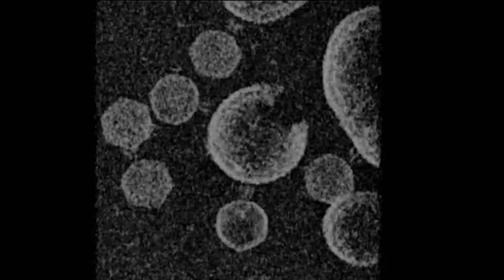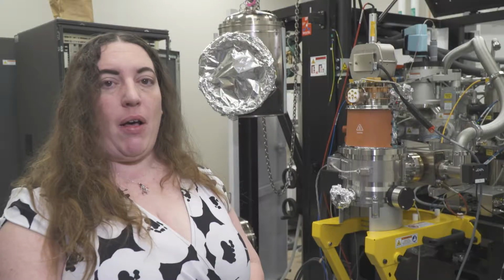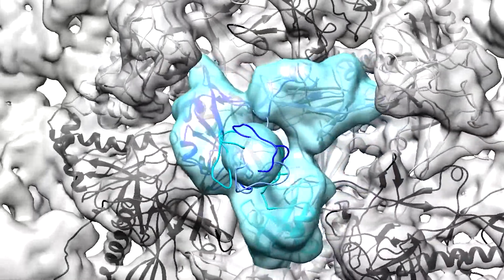Cryo-electron microscopy can be used for a number of interdisciplinary types of research. So it's important to chemists, to biologists, to microbiologists, to biomedical researchers, and to students alike. So it's very widespread in the type of research that can be done using this kind of instrument.